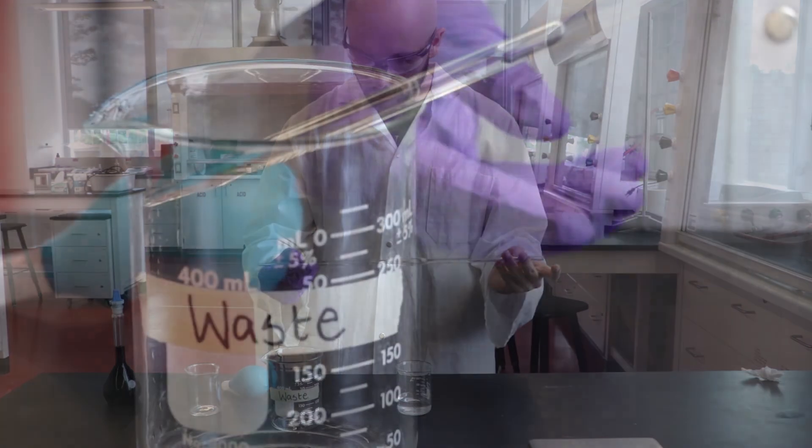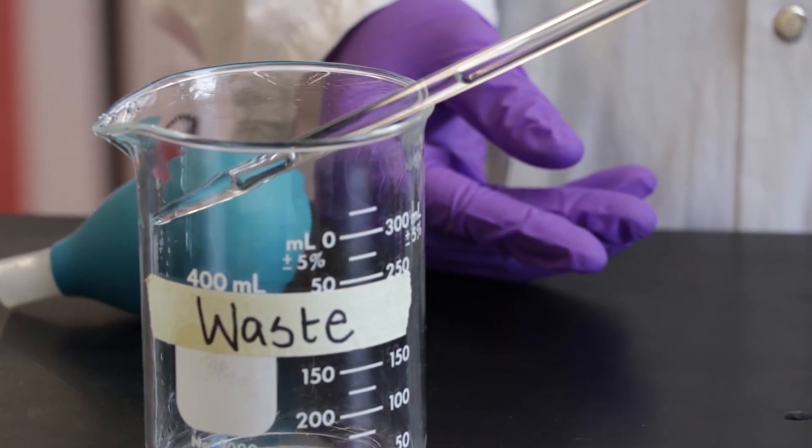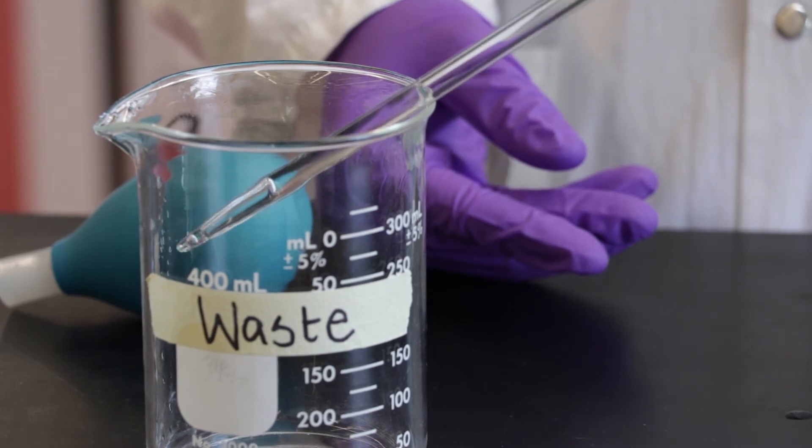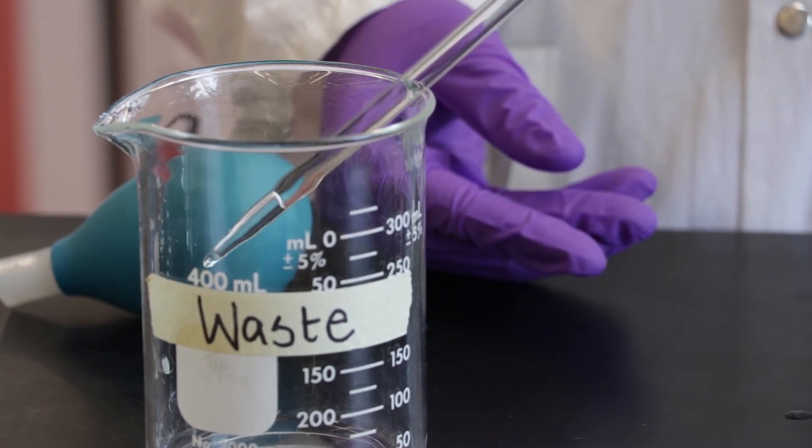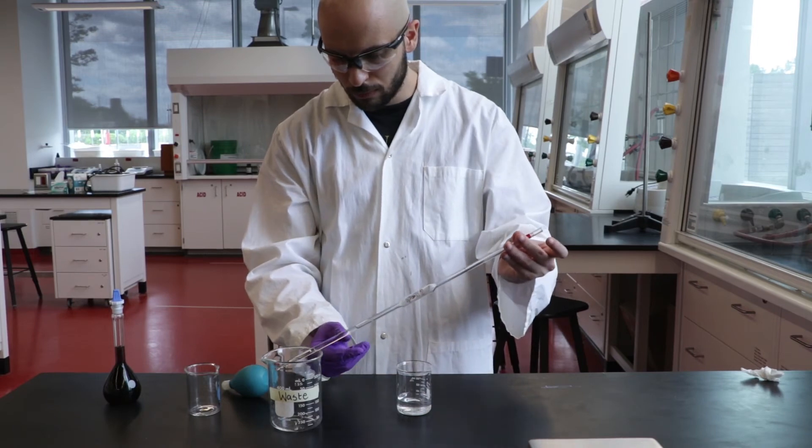If you notice that the discarded rinse is colored then further rinsing is needed. Rinse the pipette two more times. The rinse should become progressively more colorless until it is identical to water. This indicates that you have successfully rinsed the pipette.